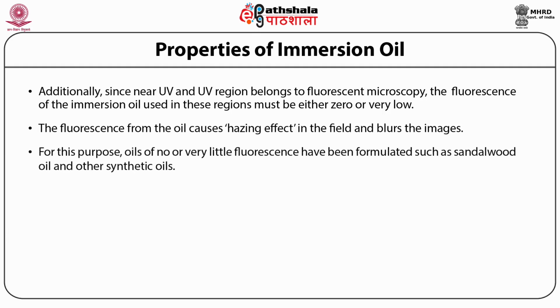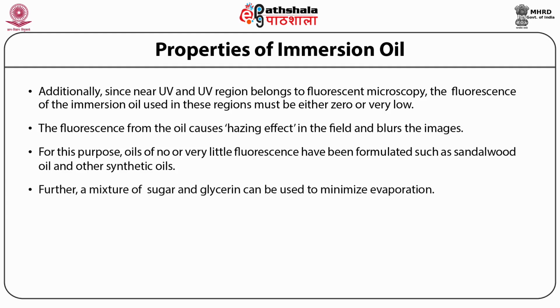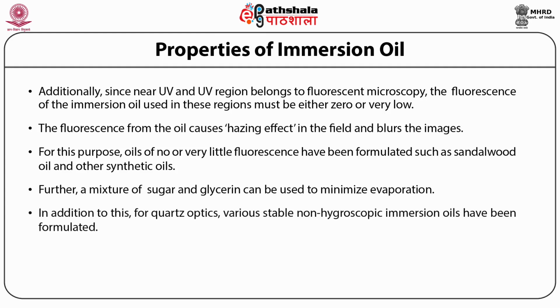For this purpose, oils of no or very little fluorescence have been formulated, such as sandalwood oil and other synthetic oils. A mixture of glycerin and water is often used in the quartz optics. Further, a mixture of sugar and glycerin can be used to minimize evaporation. In addition to this, for quartz optics, various stable non-hygroscopic immersion oils have been formulated.